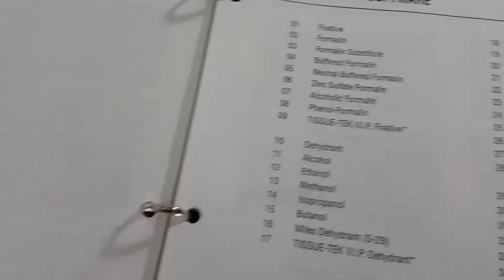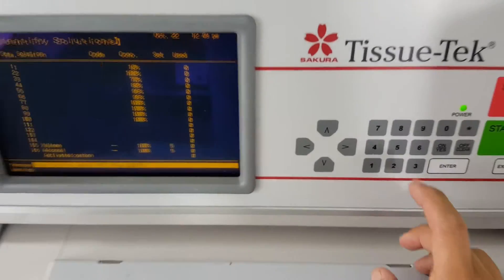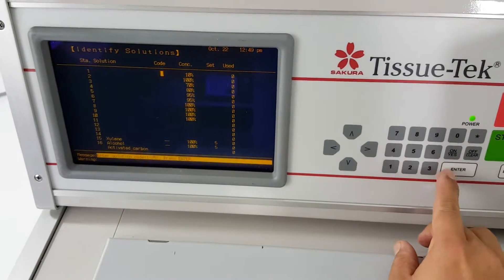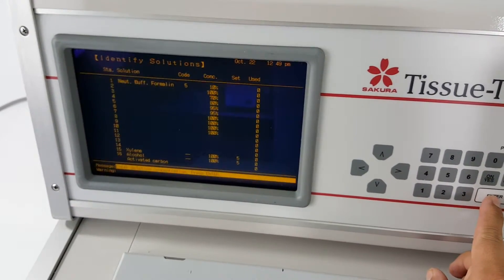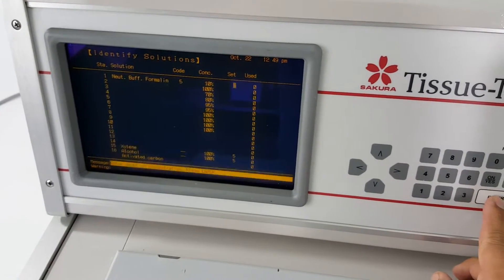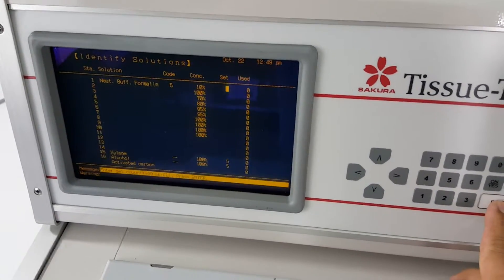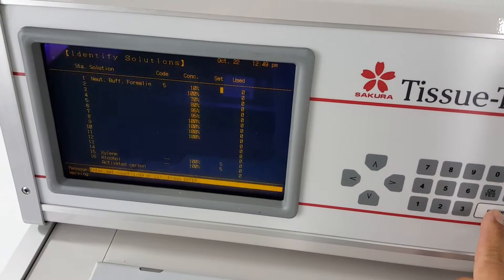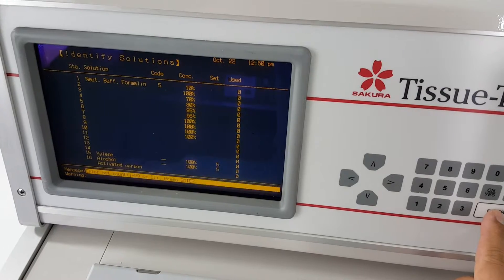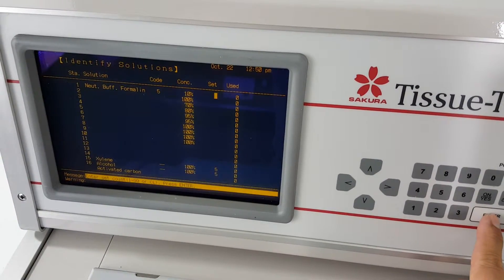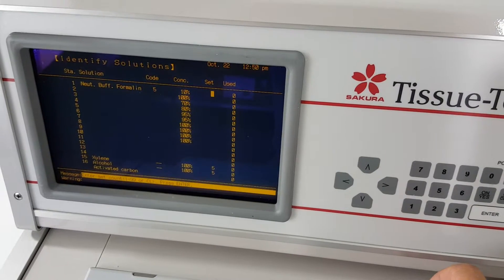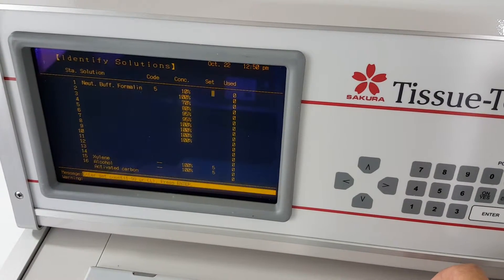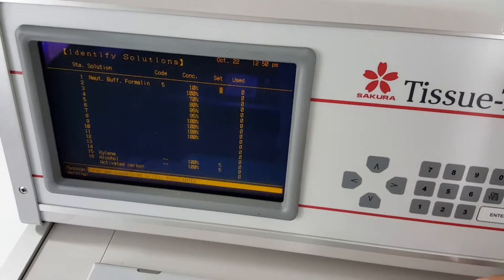So let me go back over here and so number one like I said is going to be number five. The concentration is going to be ten. Set I'm just going to leave blank. What this column does is it allows you to remind yourself that that reagent needs to be changed. If there's a six in that set column every six runs it will alert you to change that formalin.